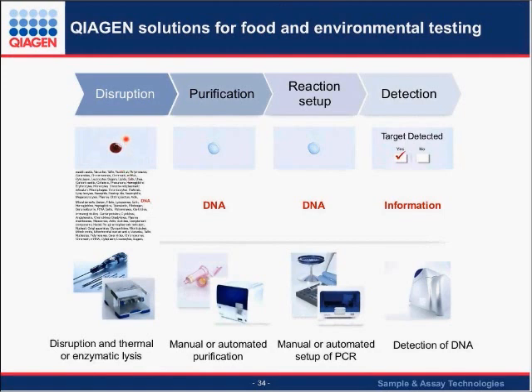For a water sample, this first step is going to be some kind of collection of bacteria or pathogen on a filter generally, or some kind of, let's call it a filter medium. And then you need to disrupt that. You need to somehow lyse the cell walls. Things like Clostridium that are very difficult to lyse, or Clostridium spores, or something that you have big challenges in the disruption.